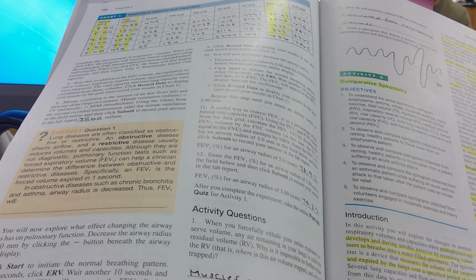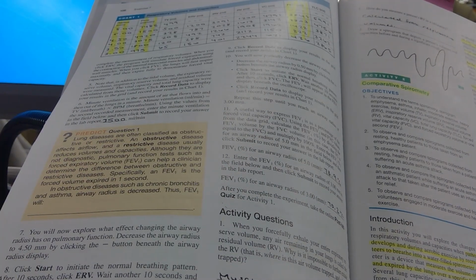I'll remind you with Poiseuille's law that as we have a smaller radius for our airways, we're going to have an increase in resistance. And if we have an increase in resistance, it is going to be tougher to get airflow through the lungs. So notice as the radius went down, so did our flow. And also notice that the FEV1, which is the second to the last column, also decreased. FEV1 stands for forced expiratory volume in the first second.